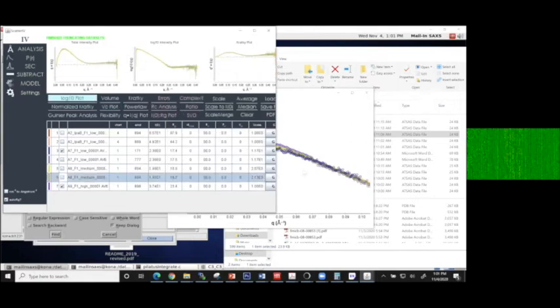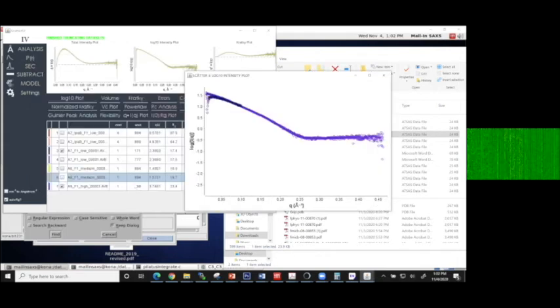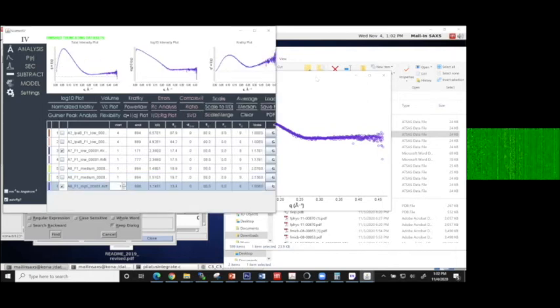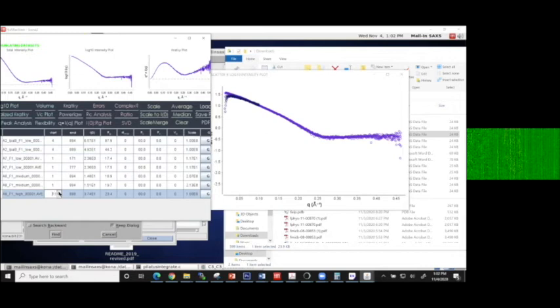And you can see that I can merge this and get the best of both worlds, like a concentration corrected sample and the high signal to noise you would get at the high concentration. So basically I just want to overlap these. I want to clip at both ends. So let's see if I can show both screens at the same time. I'm just clipping down the data, and I just want to have a nice overlap region. So I'm just dropping the number of points here.